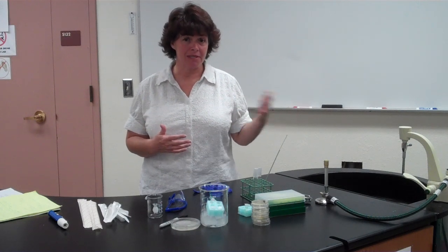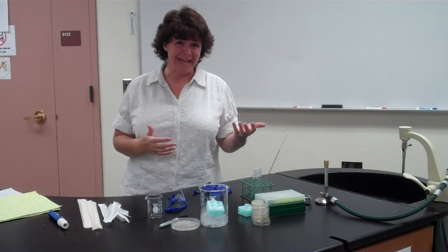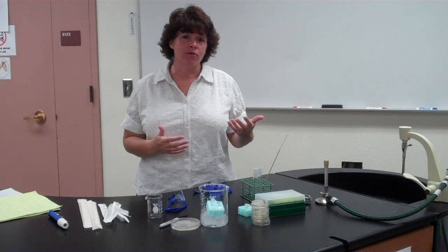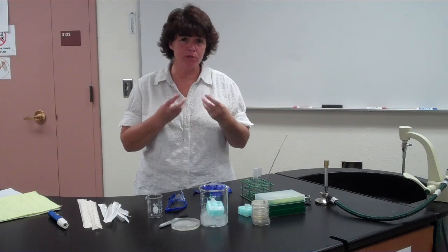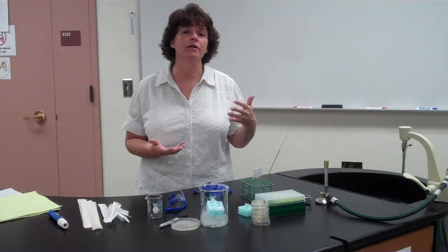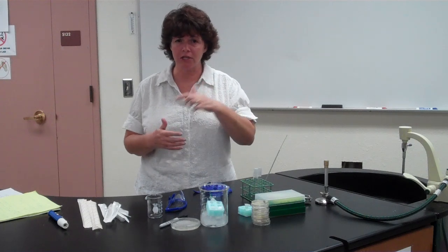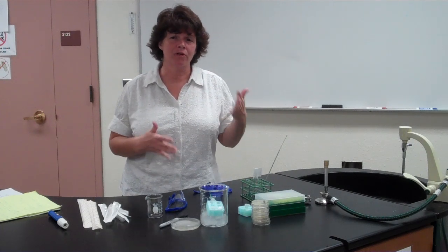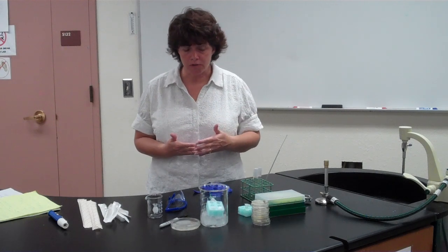First of all, we're going to give it the gene for ampicillin resistance. Ampicillin is an antibiotic. We're also going to be giving it a gene called the LAC-Z gene, which is the gene for the beta-galactosidase enzyme, which uses the sugar in the media and will cause a blue precipitate, so you'll have blue colonies. Okay? This is similar to the blue-white cloning lab that we talked about in lecture, except for we're not actually inserting that gene that interrupts the LAC-Z gene. So we're only really doing the blue part of it, but you might see some white colonies expressed also.